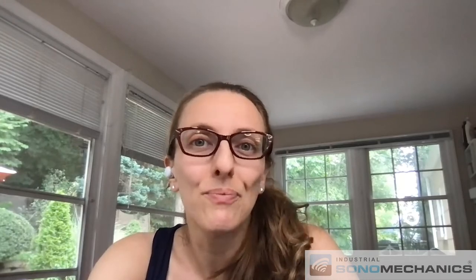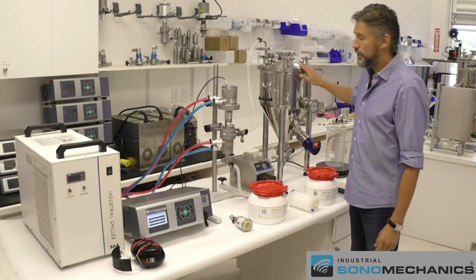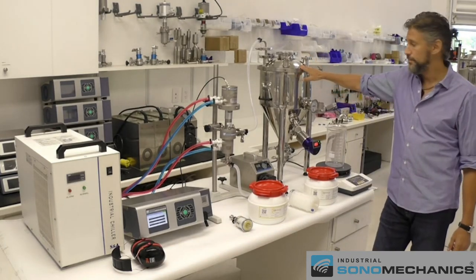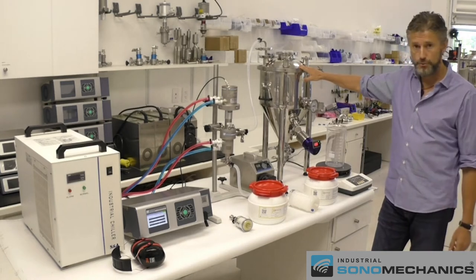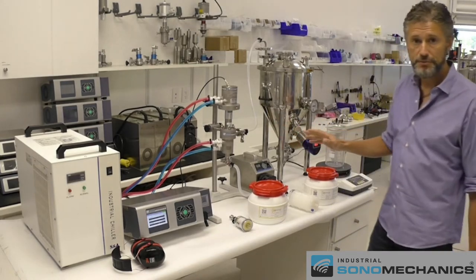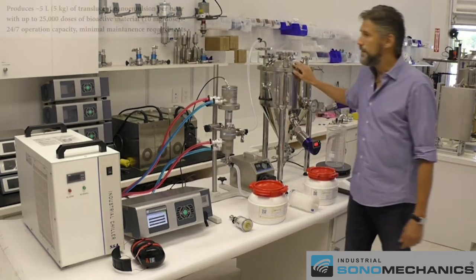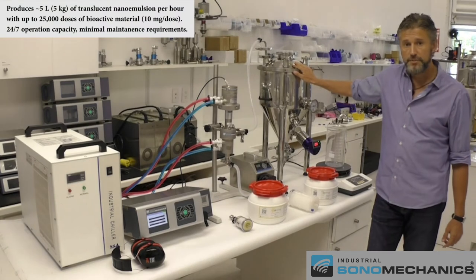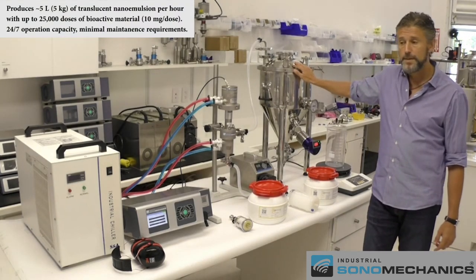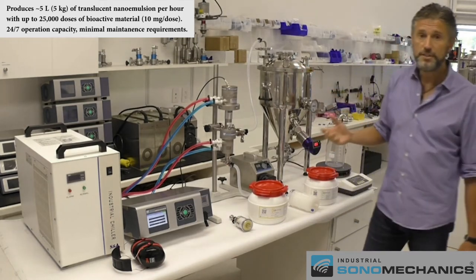Alexey, could you tell us how water-soluble liquid and powdered nanoemulsions are made with the BSP-1200? Thanks for this question, Eva. Hi everyone. This is our BSP-1200 ultrasonic liquid processor. It is configured in the flow-through mode, and currently it includes all the peripheral items relevant to the nanoemulsification process. This unit can produce approximately 5 liters of nanoemulsion per hour at a concentration of up to 50 milligrams per milliliter of the bioactive material.